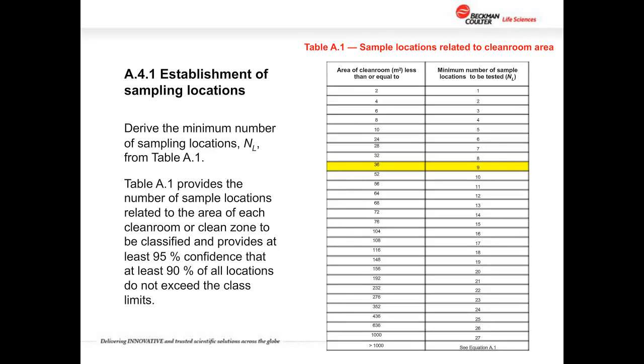So when we examine that, we say, oh, gee, I'm grade A, I'm going to have to do an additional number of points because this is pointing back to ISO 1. So you're not changing that document, you're not changing a lot of things about Annex 1, but because it does reference that and says use that method to select, it will impact your process for classifying a grade A, B, C, D area.